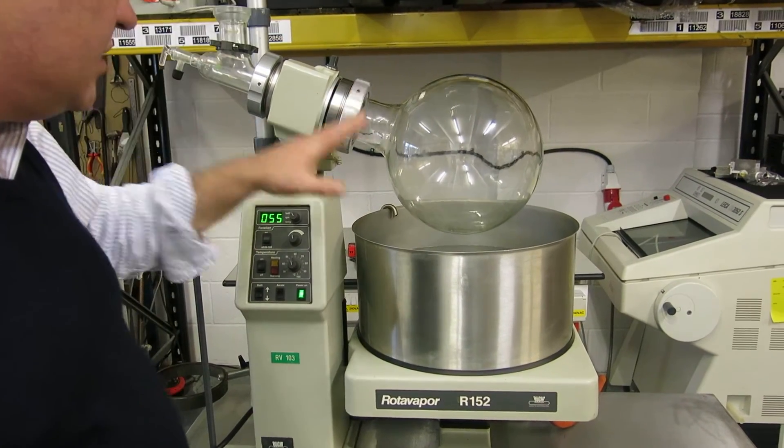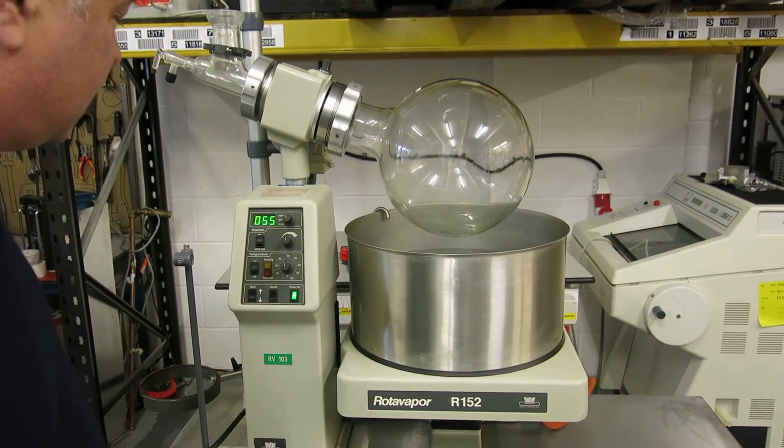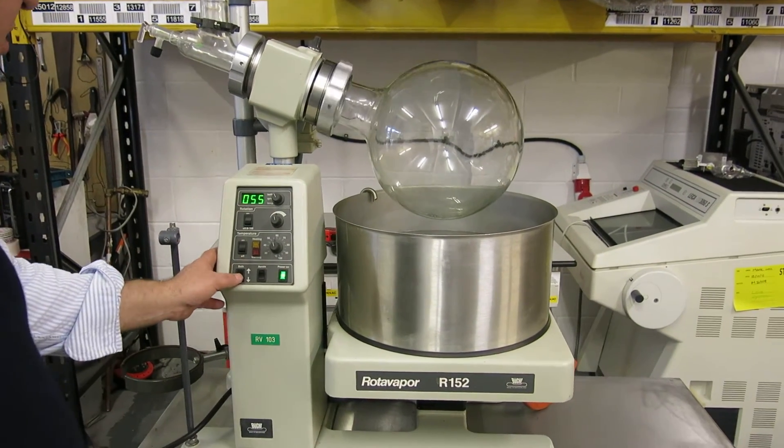This is a Buki rotary evaporator — you can see it's pilot size, with a 20-litre vessel here. It's quite an interesting device; let me show you some of the features.